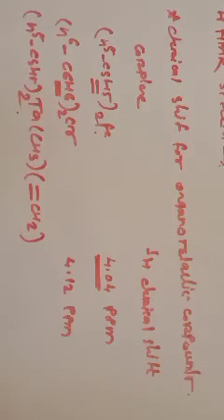When it is attached to the carbene, we can consider that this carbon is attached to this metal atom. So there is a double bond between this carbon and the metal atom. And for this proton, we are considering this carbon carbon double bonded proton.